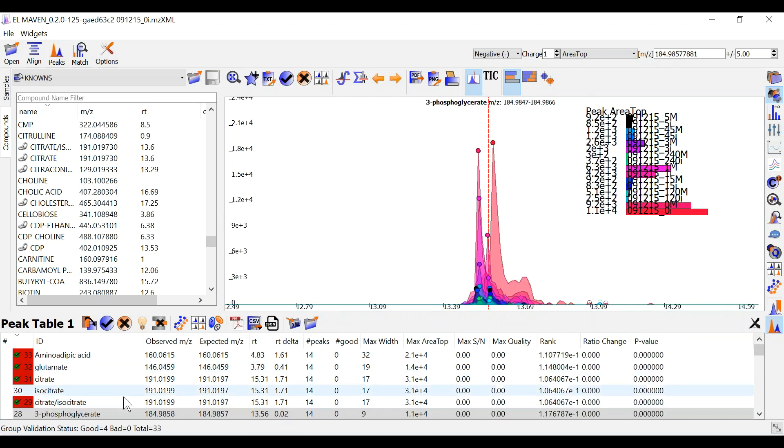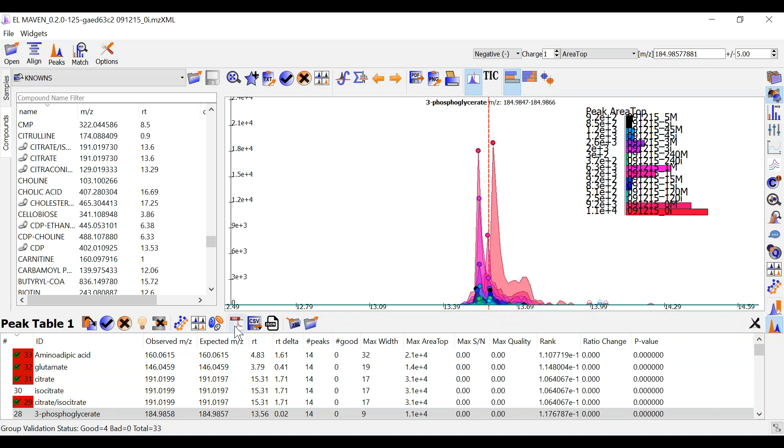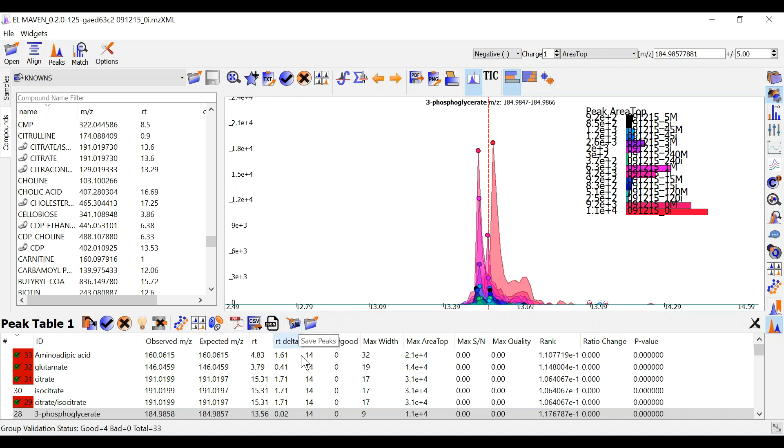Once I am done curating my data, there are multiple options for me to export the marked peak data. I can generate a pdf report with all the peaks and groups. I can generate a csv file, a json file, and so on.